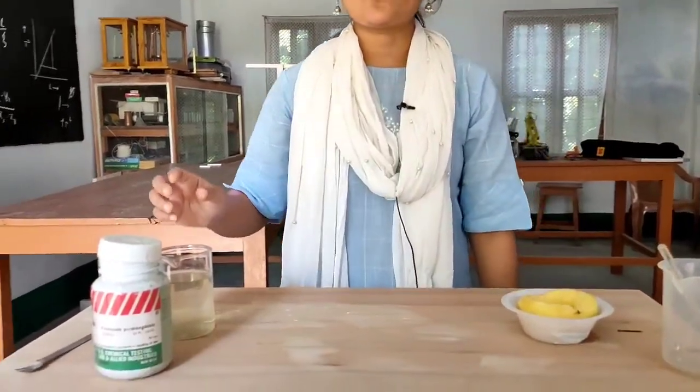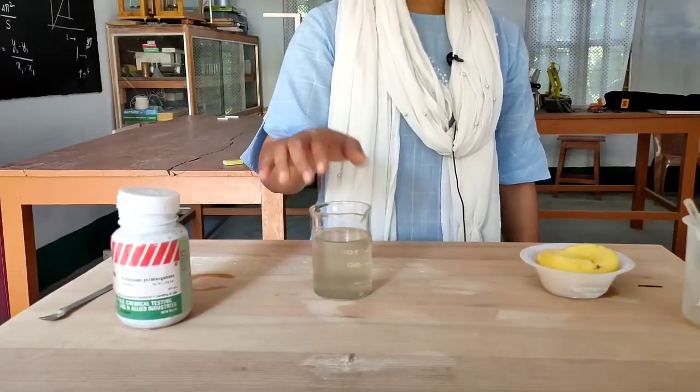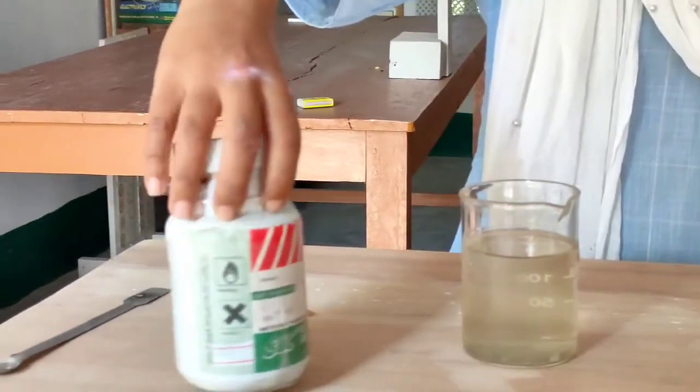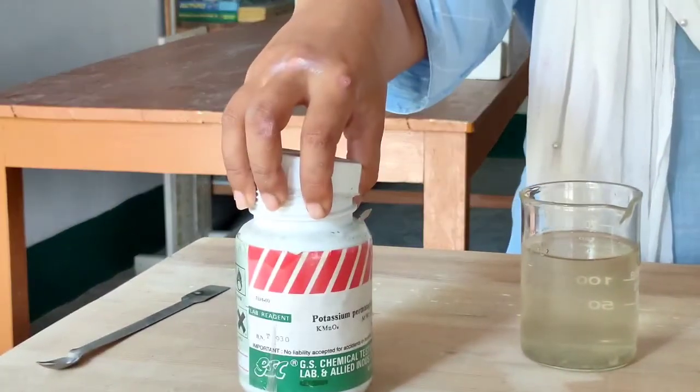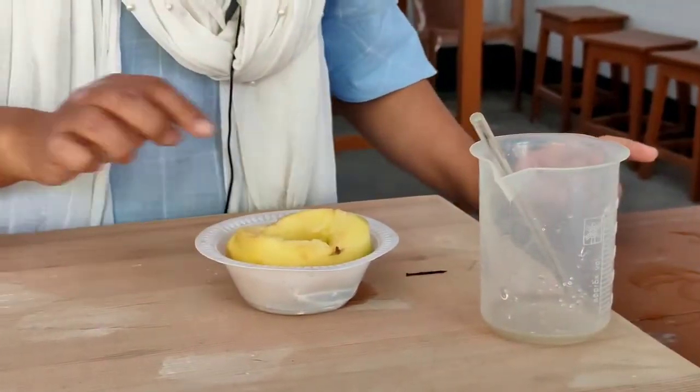Now let us first look at the materials required in order to carry forward with this particular experiment. First let us discuss diffusion. For diffusion you need water in a beaker, and then as solute you need potassium permanganate. Now for osmosis we will be discussing the potato osmoscope, that's why we have taken a potato.